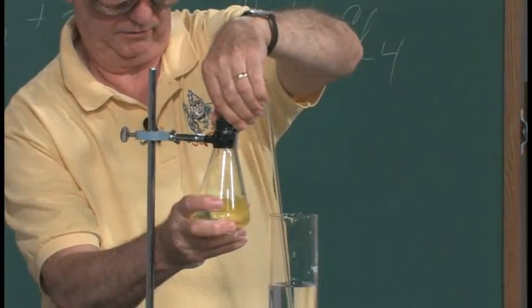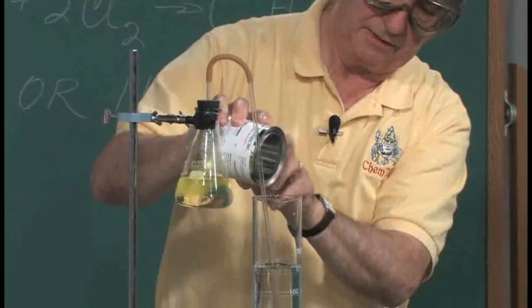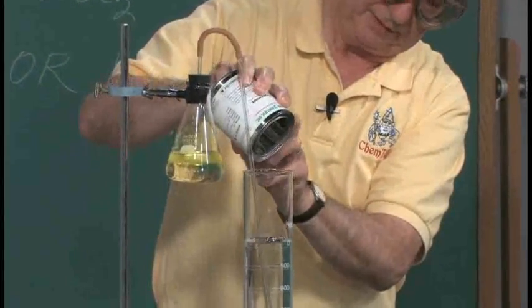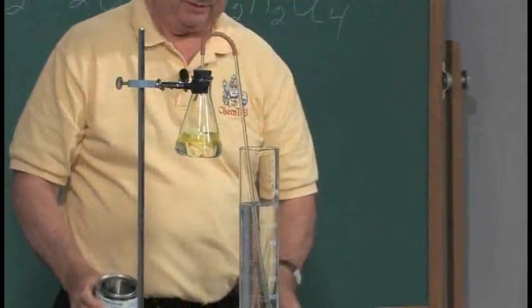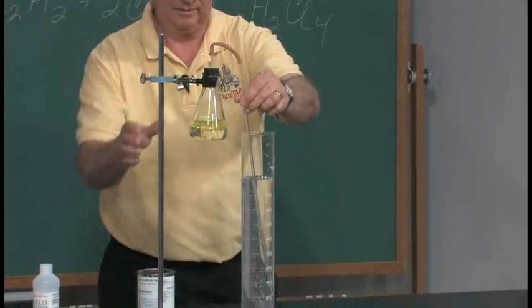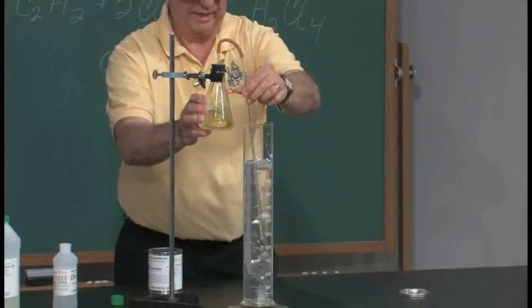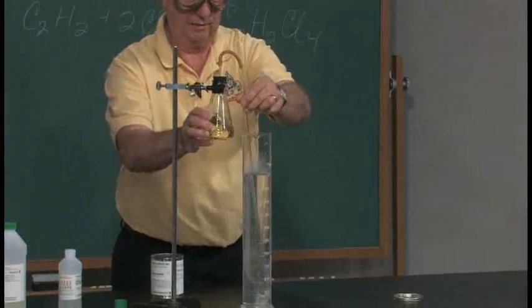You see the green color of the chlorine gas. You begin to see the... come on, come on. Dim the lights please. At first we're getting mostly air.